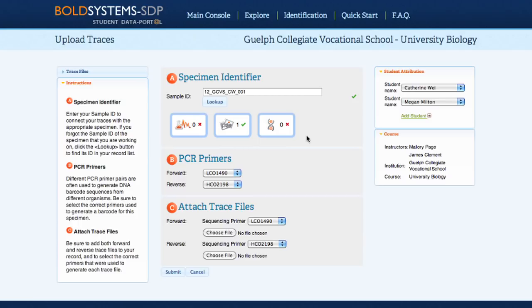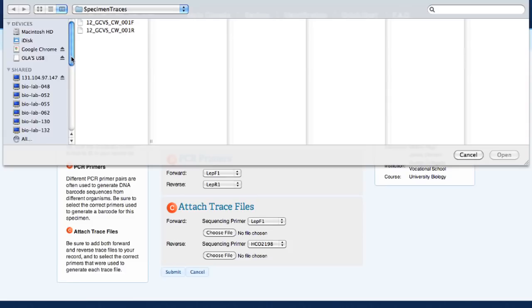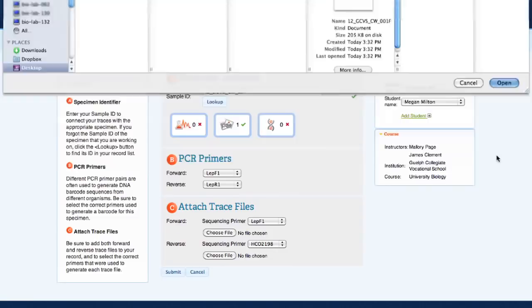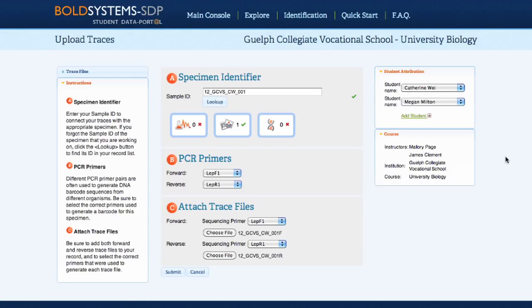Standard primers are available in drop-down menus for both PCR and sequencing. Students must select both forward and reverse primers. This information is very important as it's used during sequence editing to make sure that the primers are trimmed correctly. Students must attach both a forward and reverse trace file; both AB1 and SCF file types are accepted.